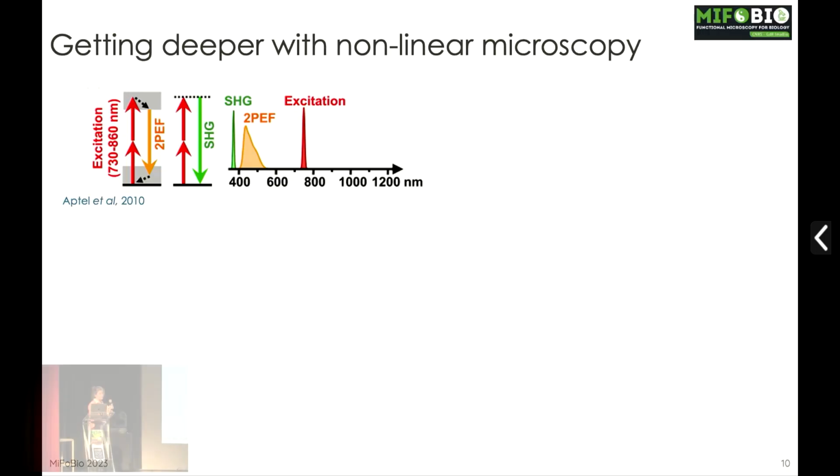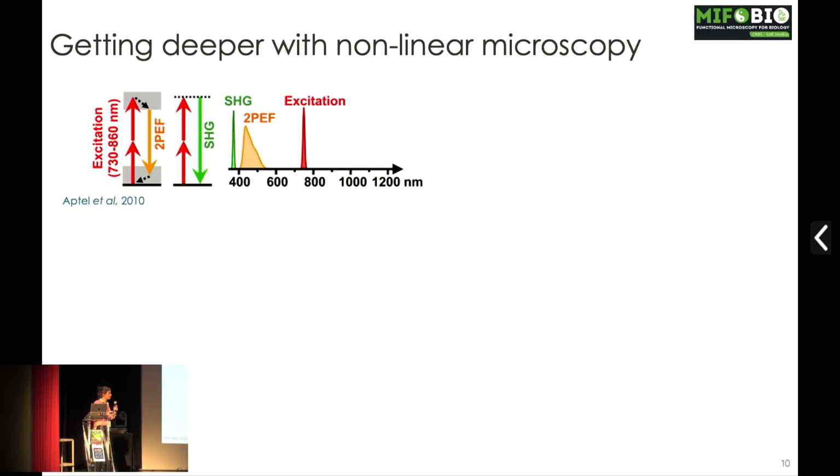So the light sheet was really also a game changer, but as I started my PhD, I was interested in two photons. I won't go deeper into the technique, because many other people more competent in that will tell you about it. But basically, instead of having your continuous blue light to excite your favorite chromophore, you use two infrared photons at the same time. Plus, as Hervé stated, you can have an extra signal for free that is very useful, called SHG.